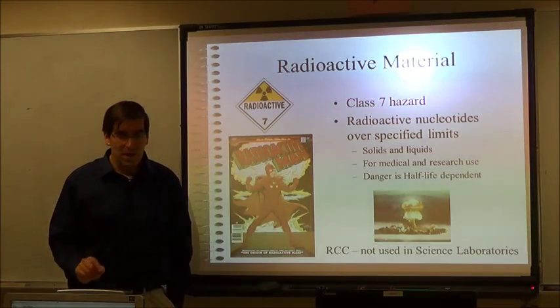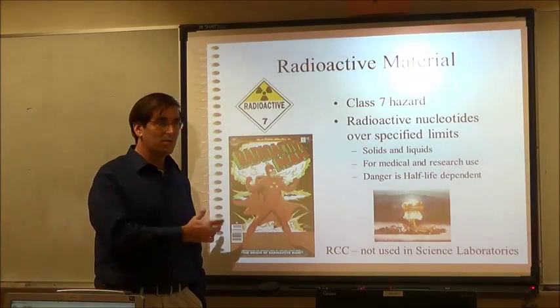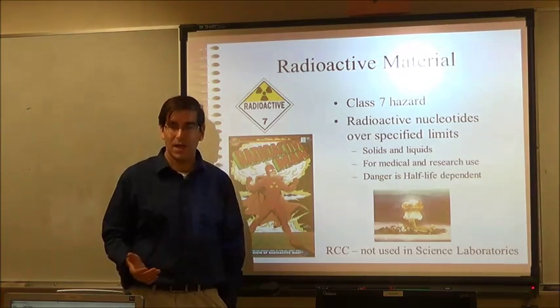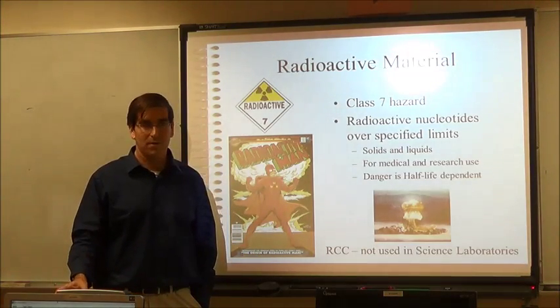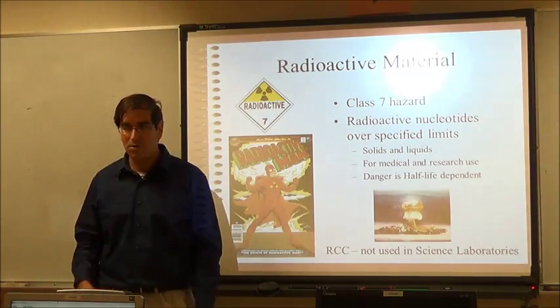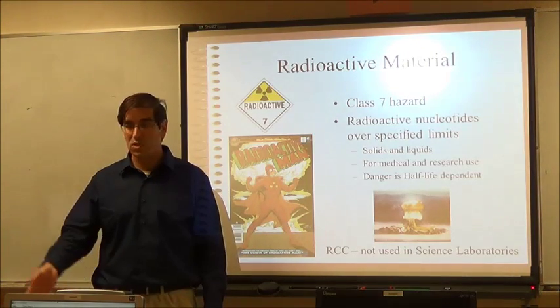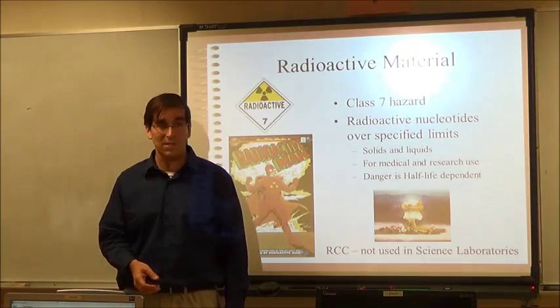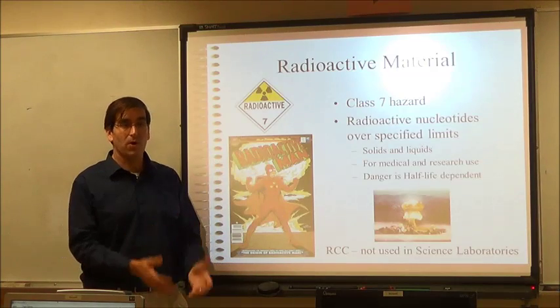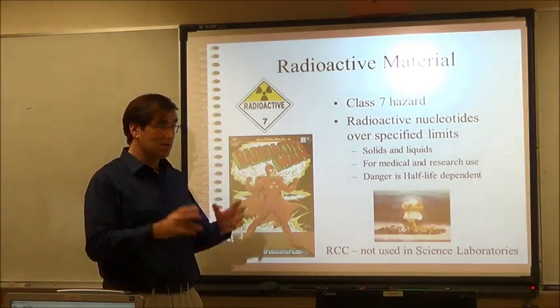And this is a very unique category because unlike the others that you could potentially leave sitting there for a long period of time, radionucleotides have a half-life. So something like P32 has a half-life of 13 days, meaning that if I take my stock of P32 today, which I have to stand behind a plexiglass shield, use gloves, use my lab coat, and I leave that sitting on the desk for, say, 6 months, suddenly I can come up to it and most likely just pick it up with my hand, I can throw it out in the garbage. And that's typically what a lot of facilities do. Depending on the half-life of their radioactive substances, they store it on site, and then they dispose of it themselves without having to go through any legal means.